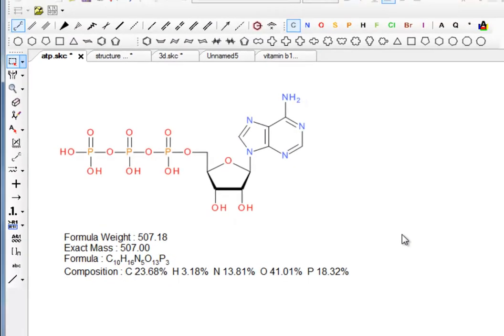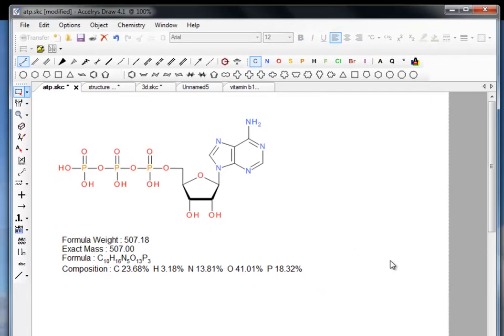So apart from anything else, if you want to quickly know the exact molar mass of ATP, this will tell you. This is obviously a two-dimensional representation of ATP. It's possible to upload an ActiveX control into AccelerusDraw 4.1 to give us a basic 3D viewer. It's quite a nice one, probably not as good as the more sophisticated ones such as RasMol or JMol, but it's quite easy to use and can give some useful insights into the shapes of molecules.